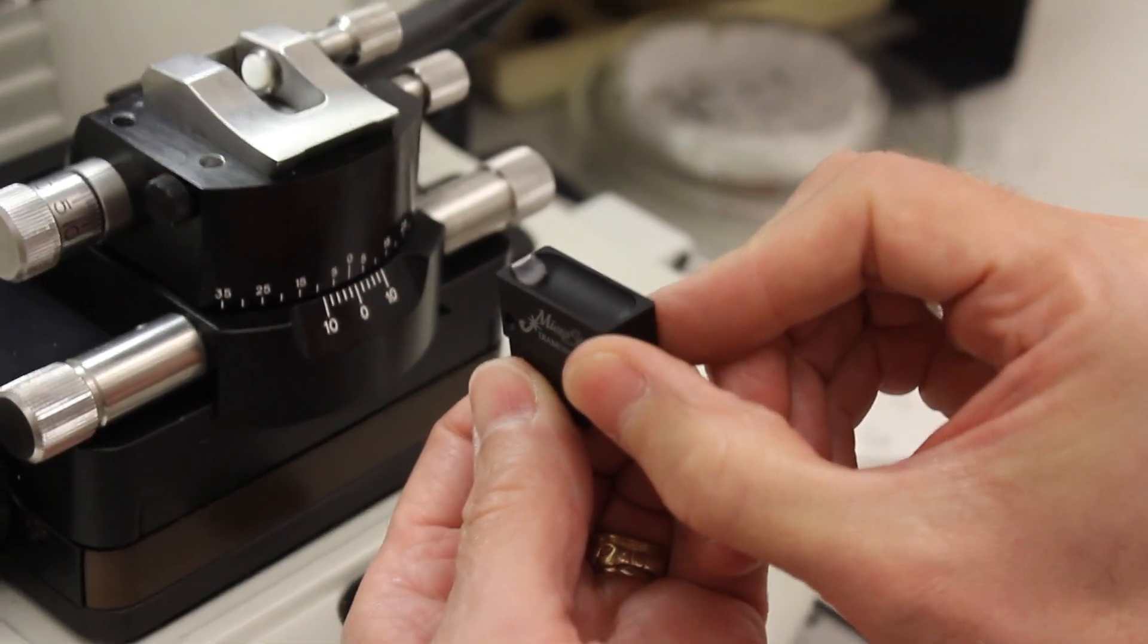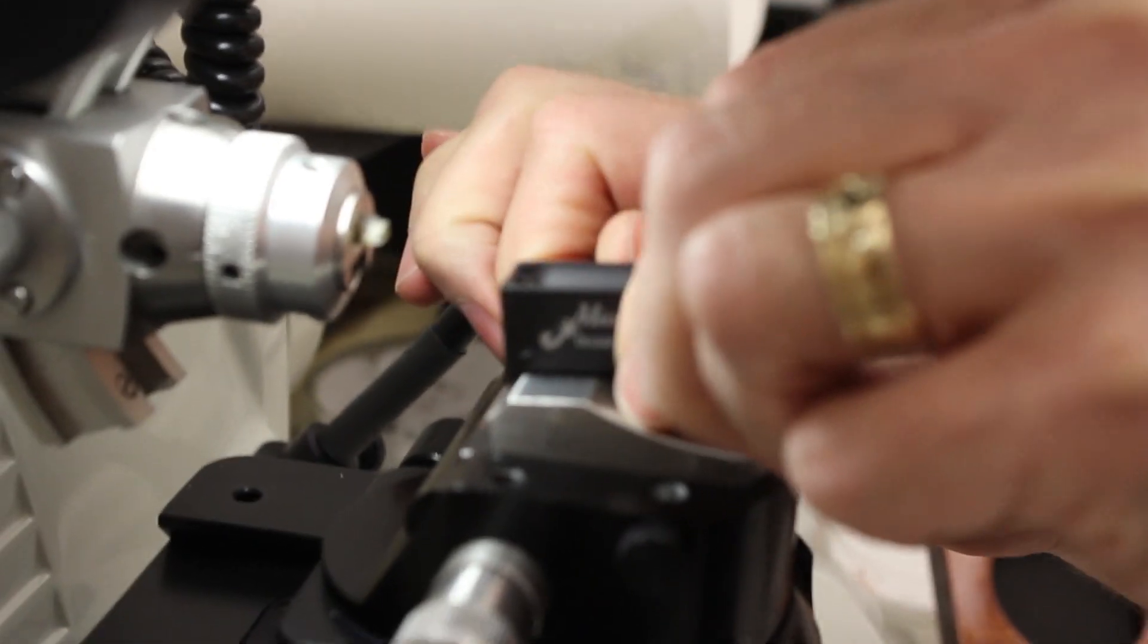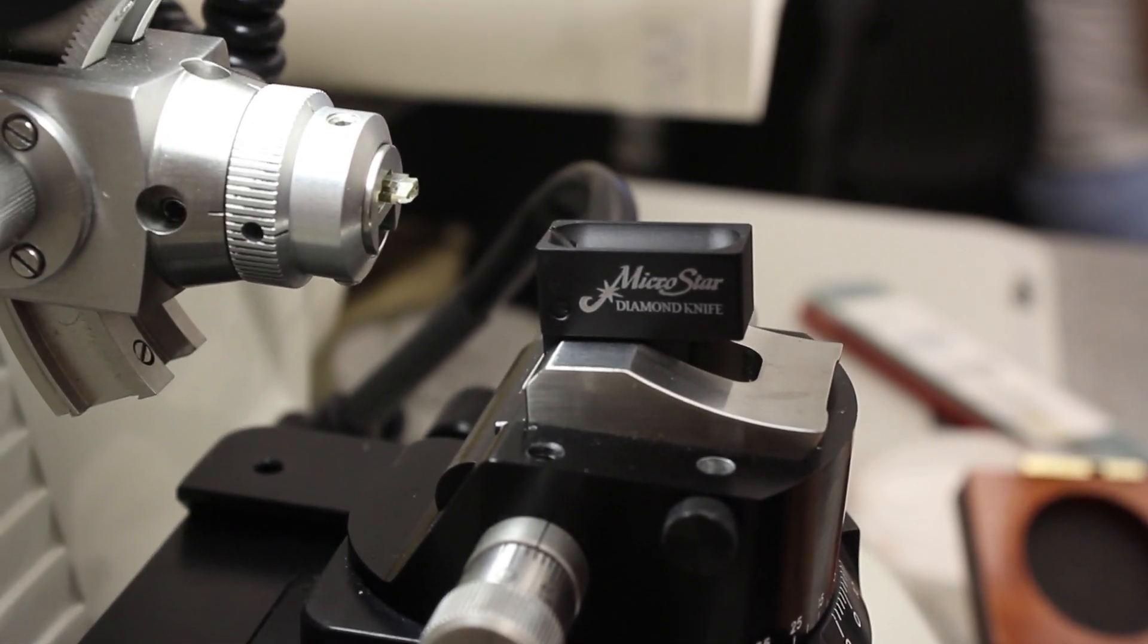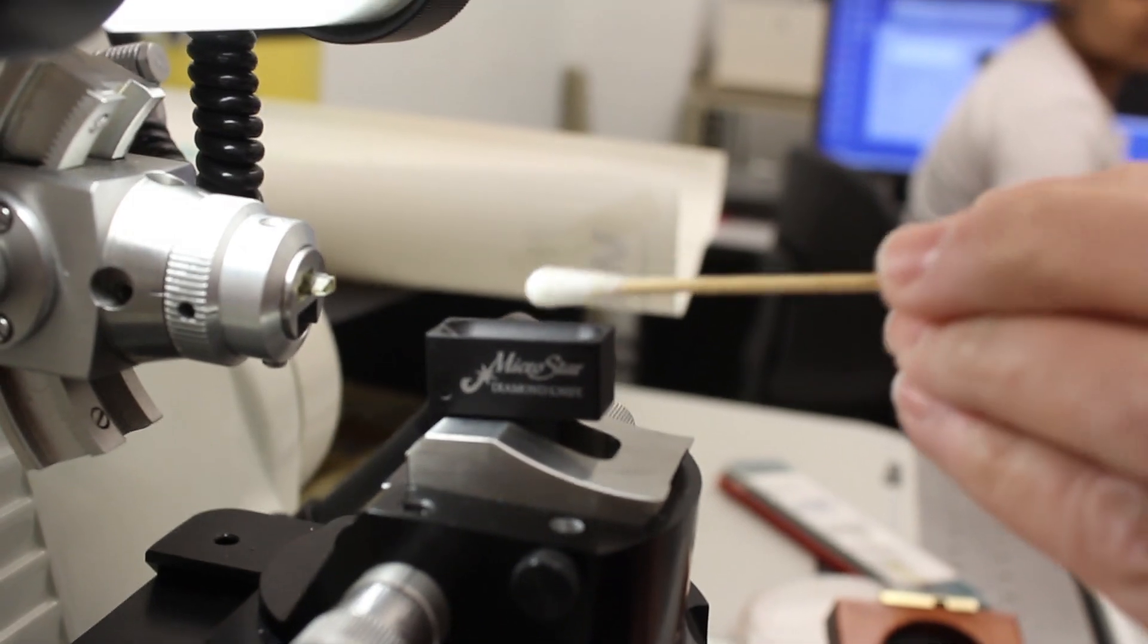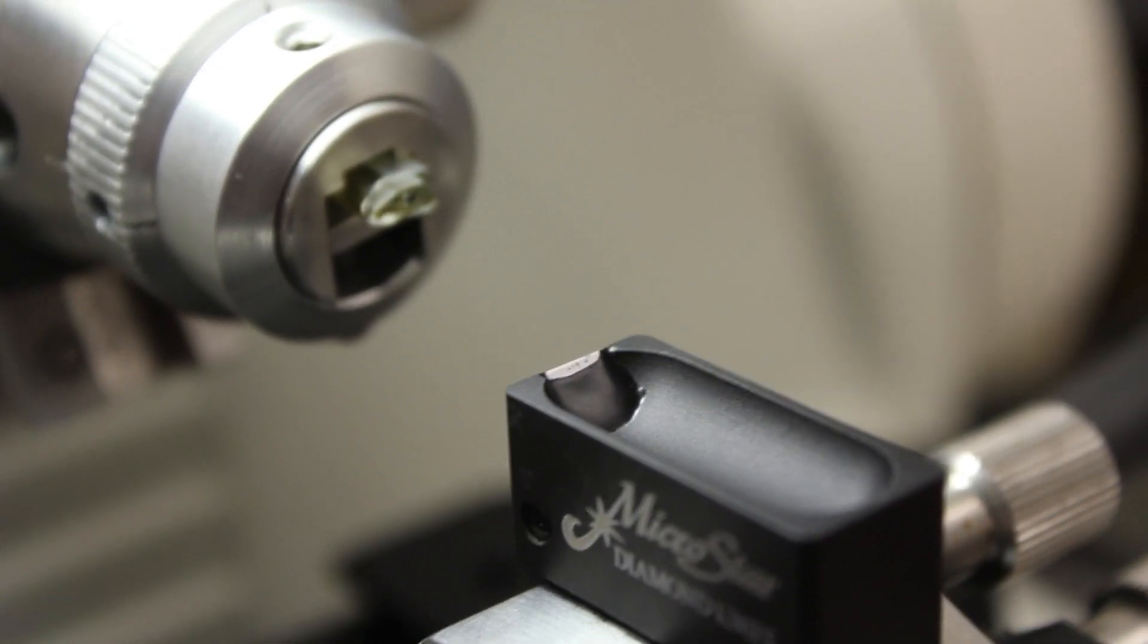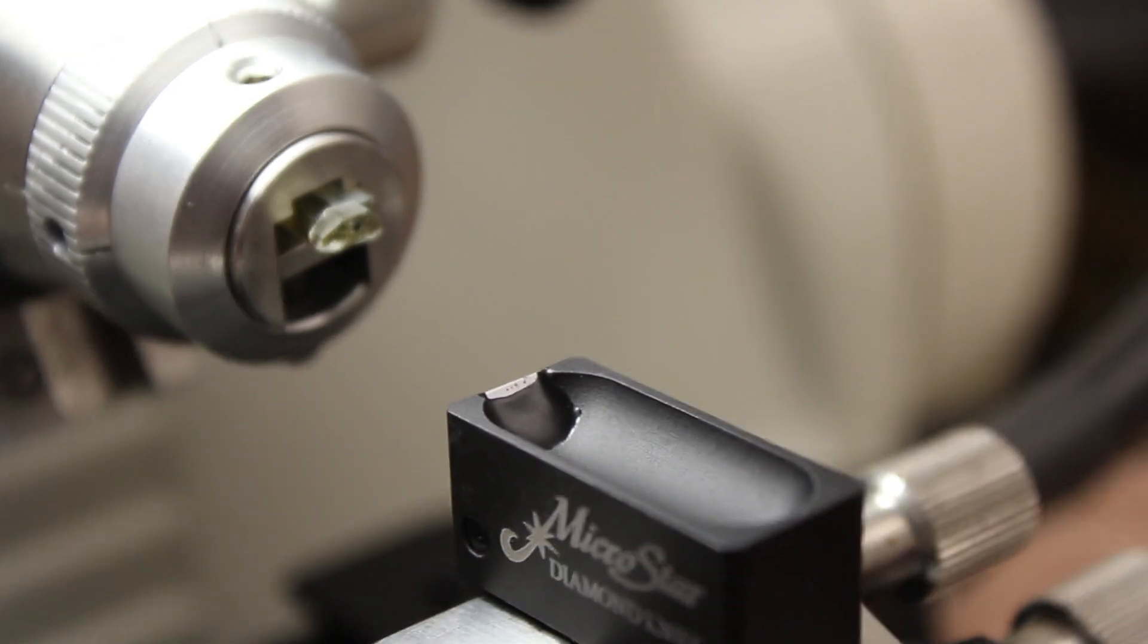This is a three millimeter wide, gem quality diamond. Where's the blade? Where's the diamond at? The diamond is that flat. You see that thin flat line right across there? Oh, so the sample goes down. I'll move this up a little bit.